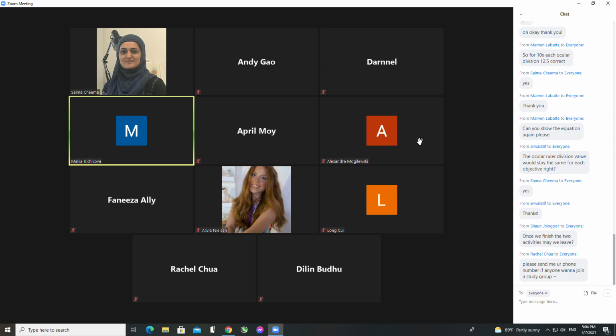Okay, I don't know why I put that number down. I'm sorry. That's all right. So what do you have now? 62.5. Yes, that's better. Are you measuring the same pollen though? You should be measuring the same pollen, so it should be approximately the same size. Yeah, it's the same one. Okay, all right. Thank you.